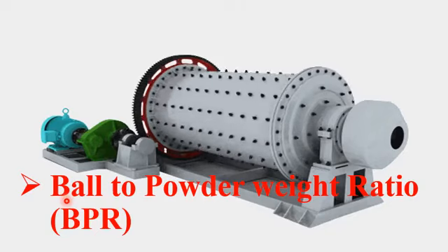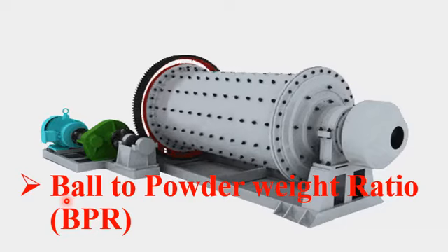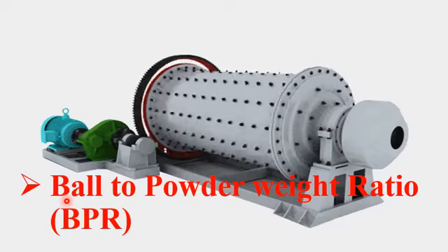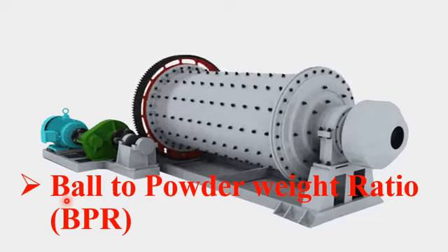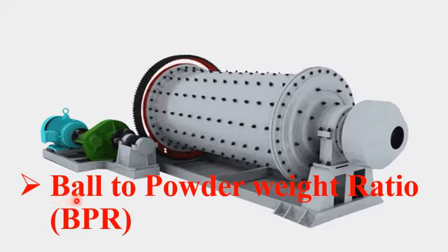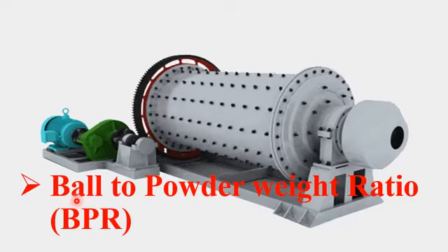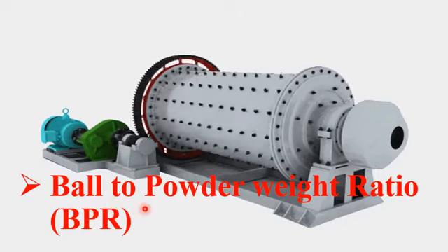Usually the advisable range of ball to powder ratio is around 10 to 1. In many situations this ratio is used. However, for effective ball milling, you can even go up to a 20 to 1 ratio. And in case of ductile charging, the ball to powder ratio is somewhere around 15 to 1.